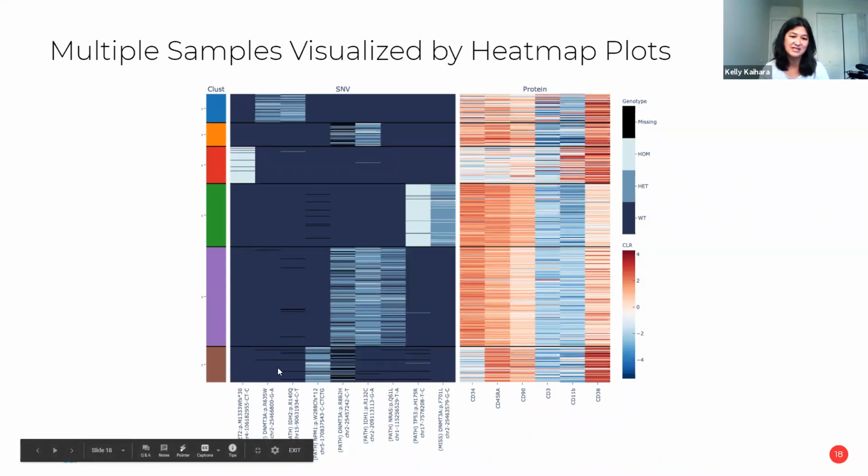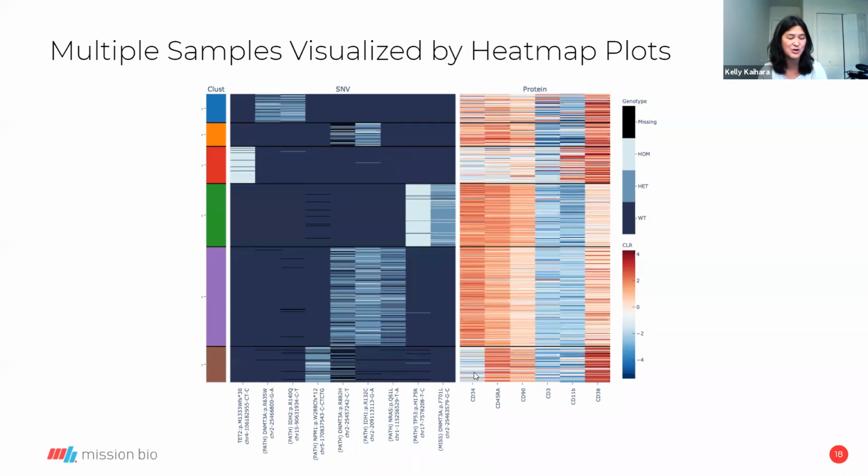So in the field, it's known that typically NPM1 mutations correlate with negative expression of CD34 protein. And so that's exactly what we see here. The patient that has an NPM1 mutation has lower CD34 expression. And this actually fits really nicely with what Dr. Stephen Chung found at UT Southwestern. He gave a webinar last week. I encourage you to check it out on GenomeWeb.